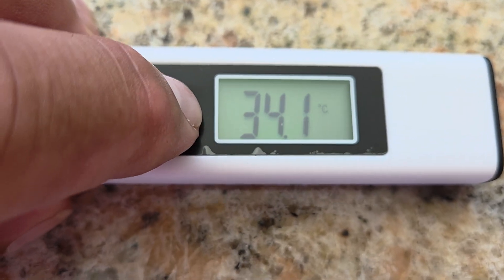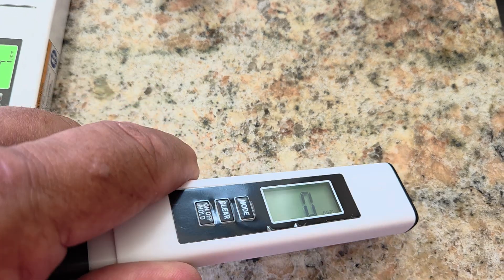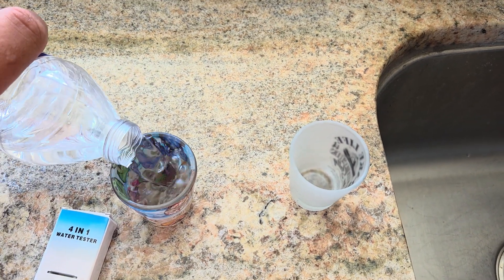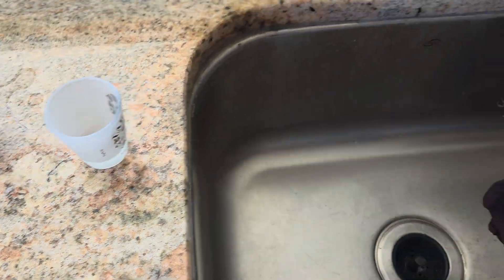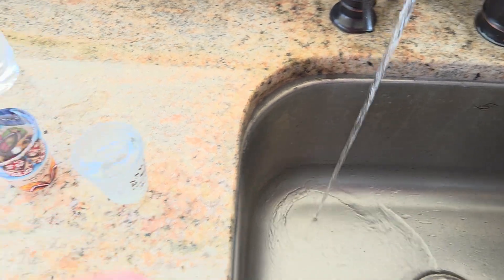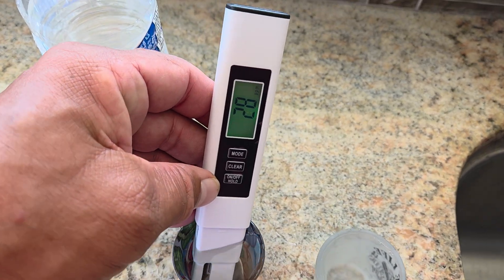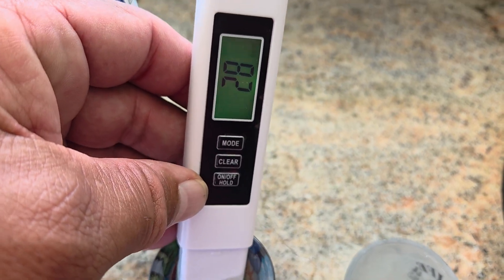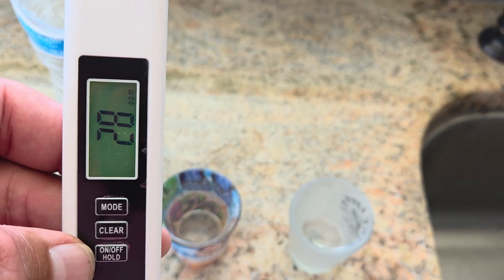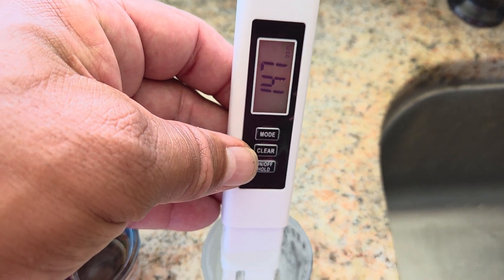It's got temperature too, so you've got Celsius and Fahrenheit. So you go back to your parts per million, pop off the cap. I have some bottled water here — I'll pour in this one — and some tap water in this one. And you can see the tap water is like 28. You just let it dry off a little bit, hit clear, go to your next one. This is the tap water, and the tap water is 147.